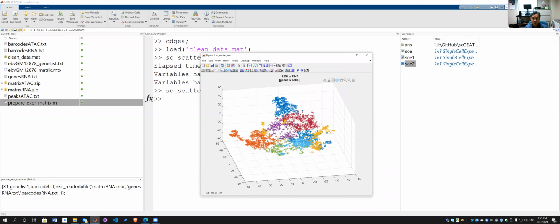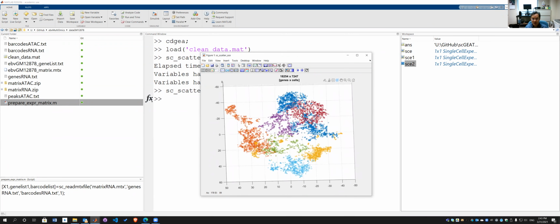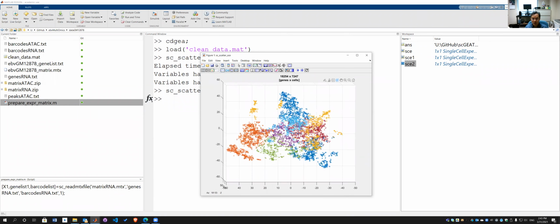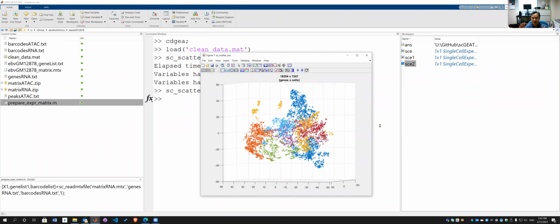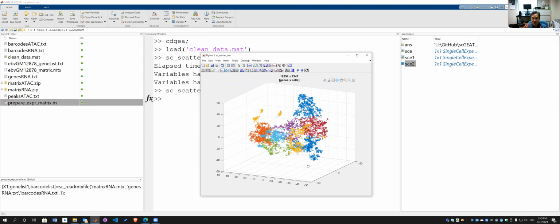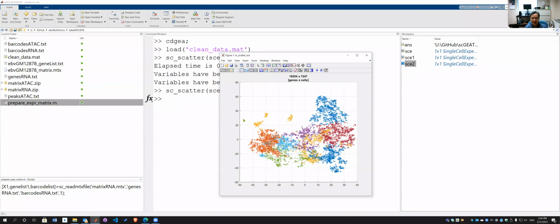However, sometimes you don't want the default coordinates. For instance, if at this angle you want to keep a projection of the cells at this particular angle, you need to select using the current view. If I use the current view, I will maintain the angle of what I'm seeing and project and scatter the data points, instead of using the original x, y axes to present them.